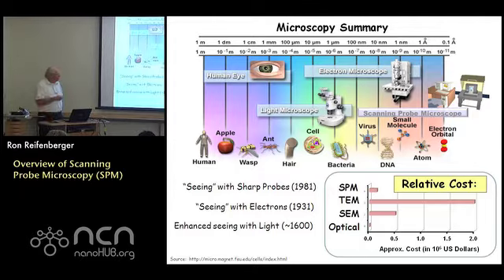The scanning probe microscope is not as inexpensive as the optical microscope. It costs about $100,000 to $150,000. There's probably 20 to 25 of them at Purdue. There's about a half dozen of those instruments in this building, this Burke Center right here, right? So there's 2 or 3 labs that are devoted to scanning probe microscopy.